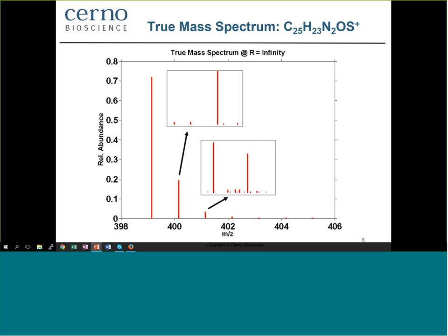Due to this information being lost in the centroiding process, the determination of elemental composition is only considered feasible when the monoisotopic mass of the ion can be accurately determined to within a few ppm accuracy from a high-res mass spec system, such as a time-of-flight system, Orbitrap, or other high-resolution mass spectrometer.